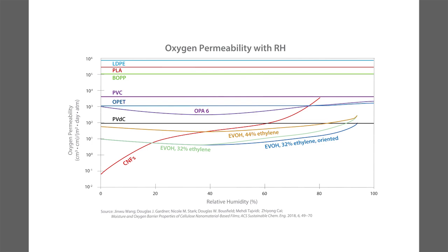So there's a lot of good thought into materials and the structures when they're assembled and put together, based on what barrier properties you need. If you think of a multi-layered structure as an EVOH, which here is a relatively good barrier, embedded within polyethylene, you'll see it does a great job of bringing that polyethylene down quite a bit when you put a multi-layered structure together and stack them together.